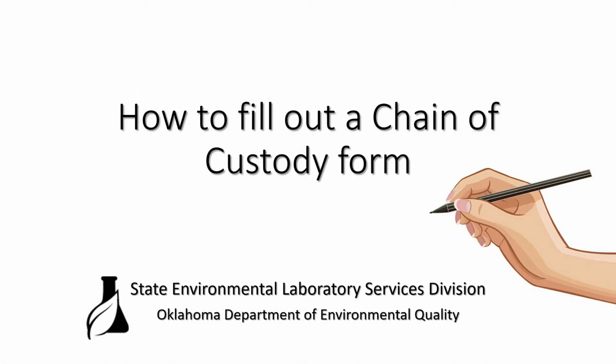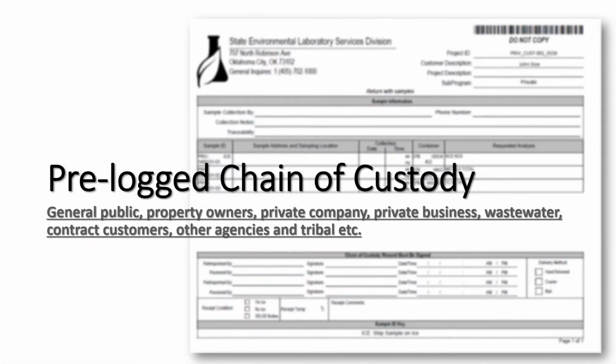Welcome to the training, How to Fill Out a Chain of Custody Form, brought to you by the State Environmental Laboratory Services Division. This training will describe how to complete a prelogged chain of custody form.